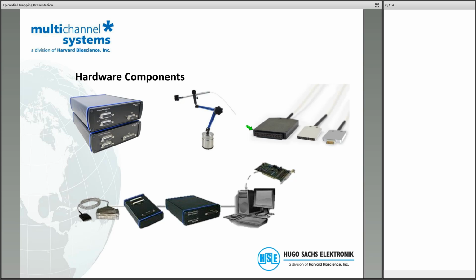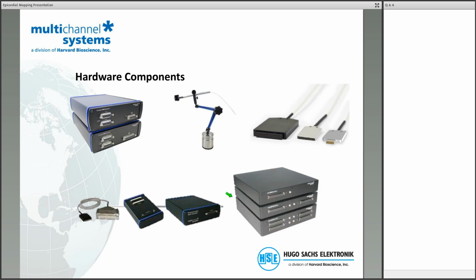And then from the head stage amplifiers, you're going either to a signal collector, and in the second step, to a separate filter amplifier unit, and then you go into the AD conversion unit or into the computer. We have a second module for the AD conversion. You've seen the old PCI slot-based card there. With this version, you have now USB-based data acquisition modules with 64, 128, up to 256 channels. And I already said that is a classical approach.